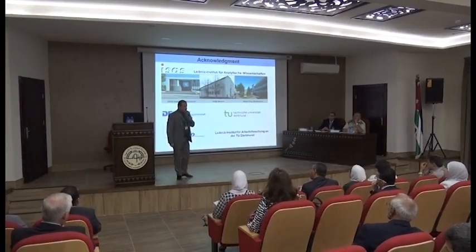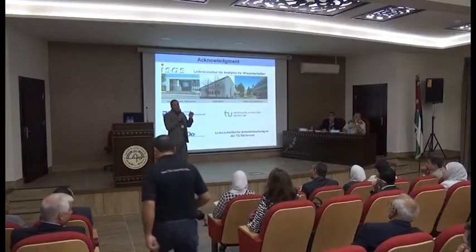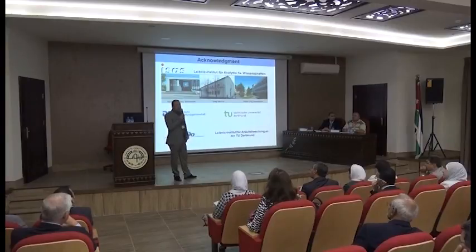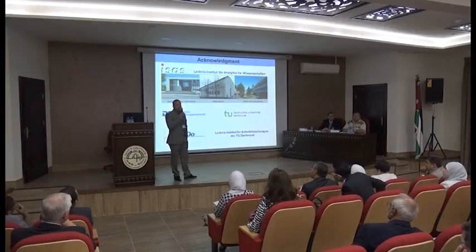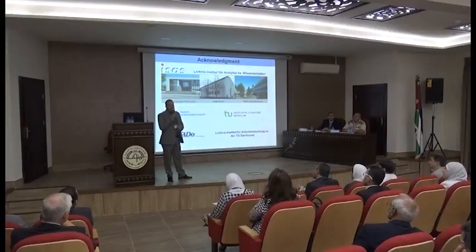Let's go to the first question. We can measure the platinum or the anti-cancer drug inside, outside, and also in the plasma. The reason is the different relaxation correlation. Then they have different frequency and different chemical shift. And we also have to use relaxometry, called NMR relaxometry.